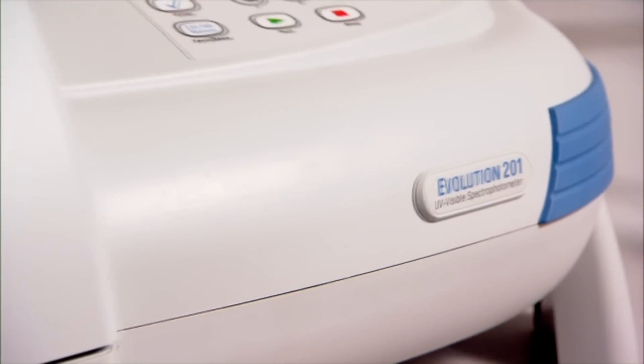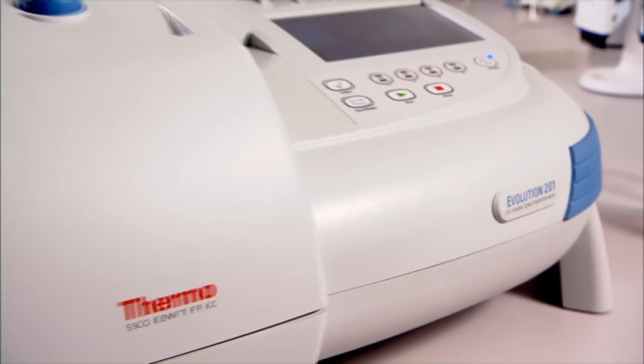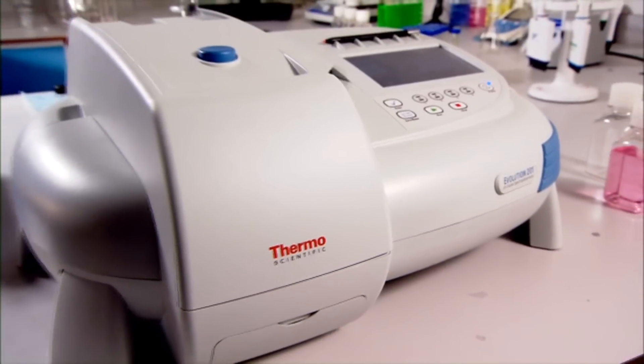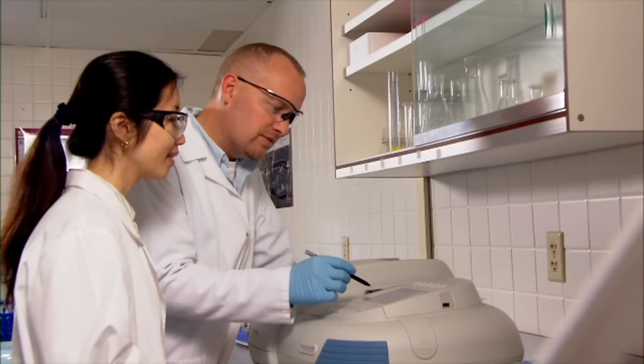The most technically sophisticated, accurate, and easy to use UV visible spectrophotometers. Your results speak for themselves.